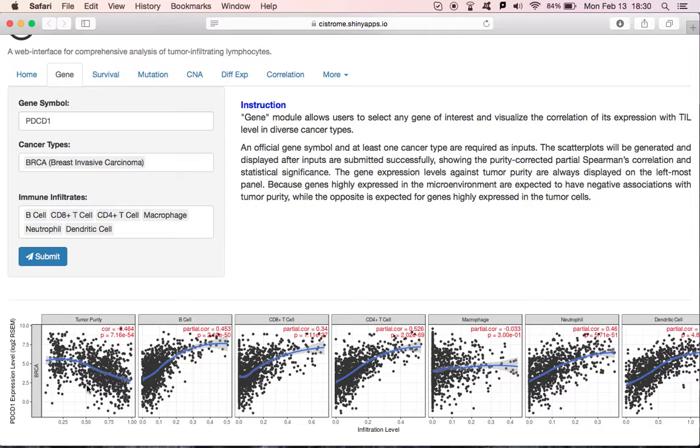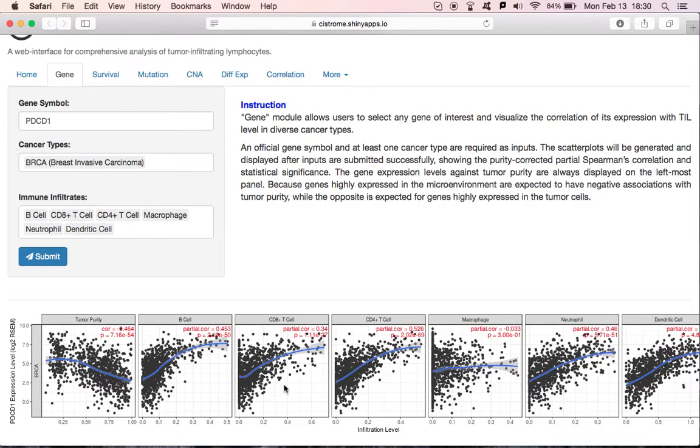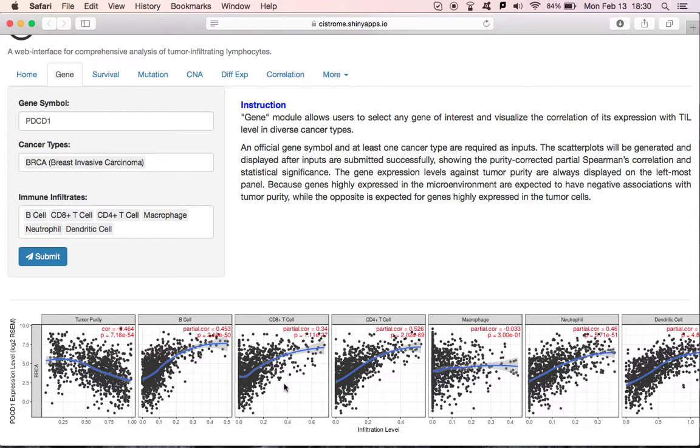For each immune cell, we calculate their partial Spearman correlation adjusted by tumor purity. Look at this plot. That means in breast cancer, if there are more CD8 T-cells, PDCD1 is higher expressed.